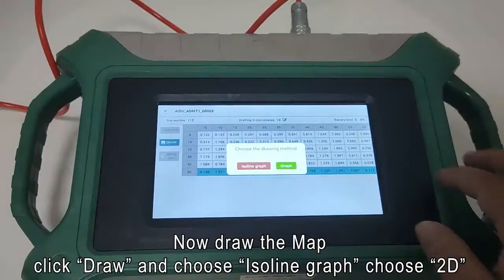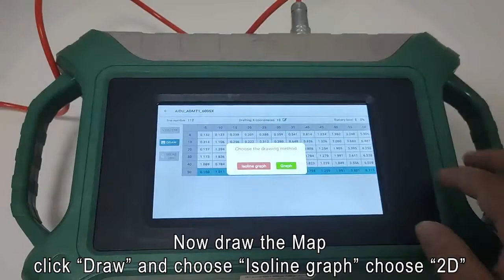Now draw the map. Click draw and choose isoline graph. Choose 2D.